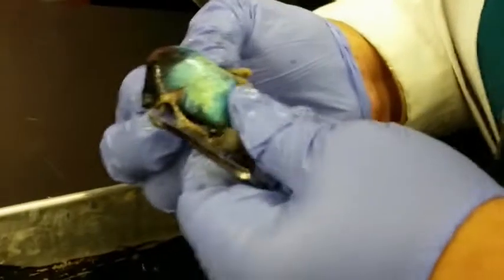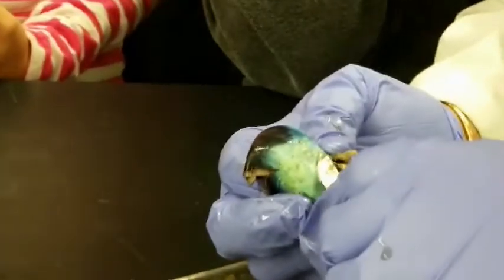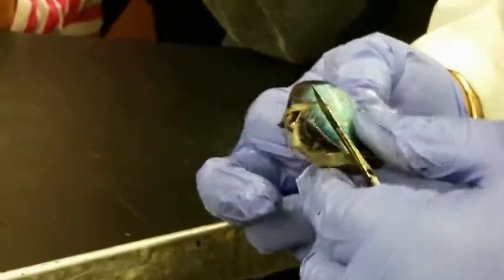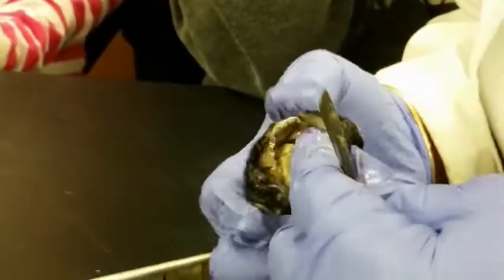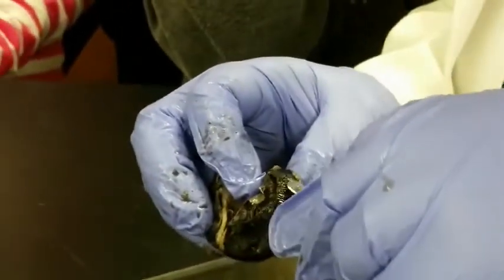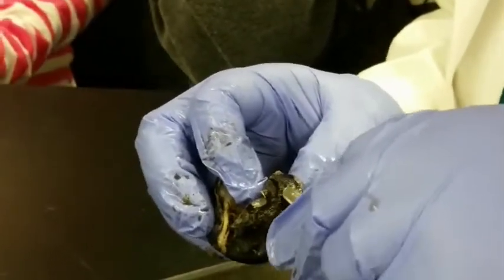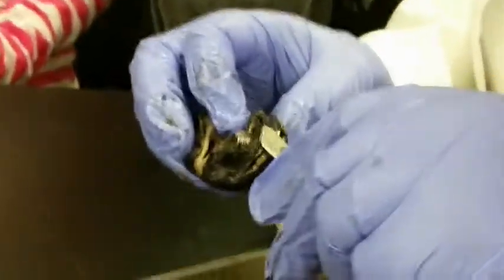So in front of the optic nerve, this doesn't show it well, but you should have a little bit of gathering there that would make the optic disc. So we'll find one that is nice and testable. And now, what is this that goes around? The feathery structure. What is it?